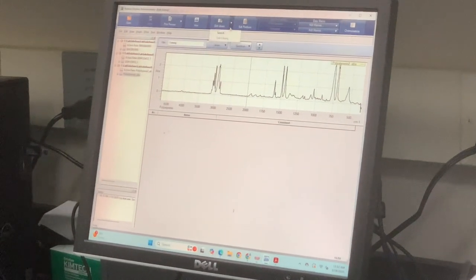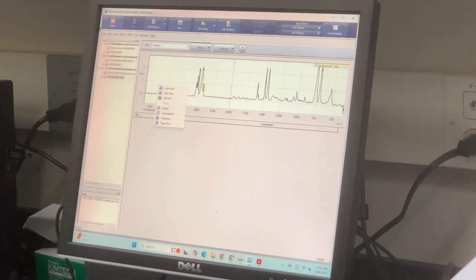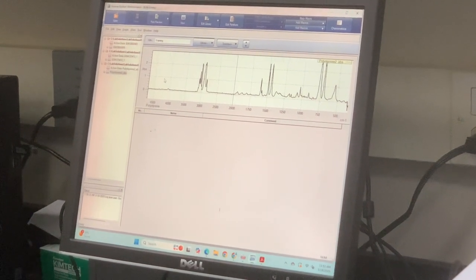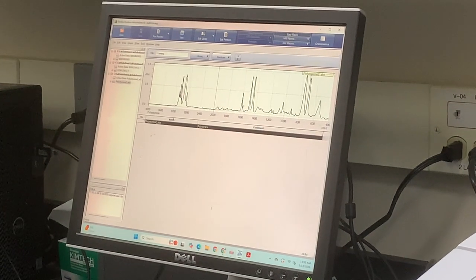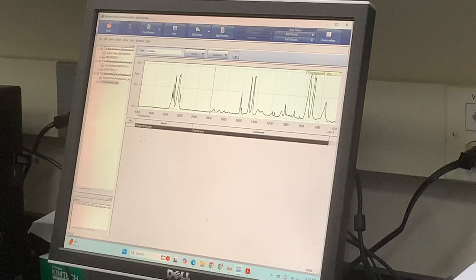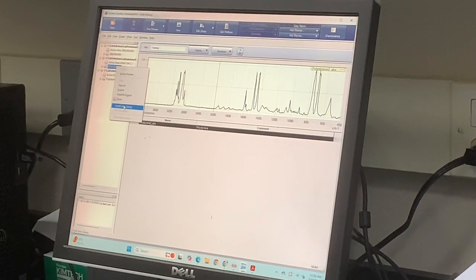So, comment on that, choosing that range: you can have your same data file duplicated or run again with a different range. It would let me drag and drop, but I don't know why it didn't this time. So remember, the first thing we want to do is open those data files. You're going to right click on those data files and select insert into library.